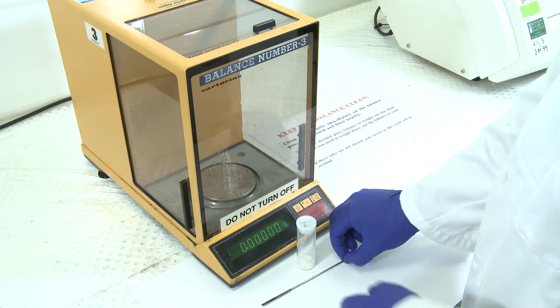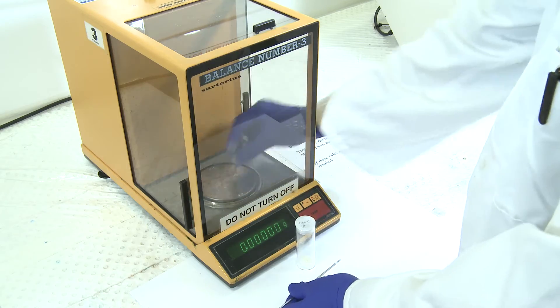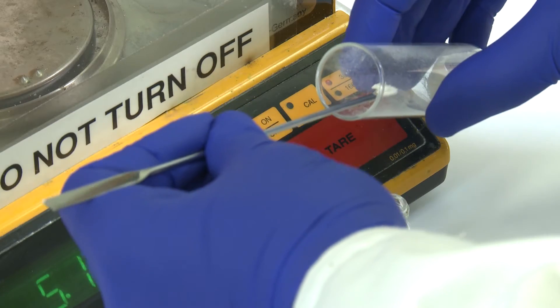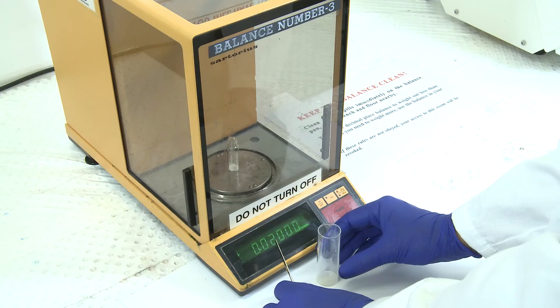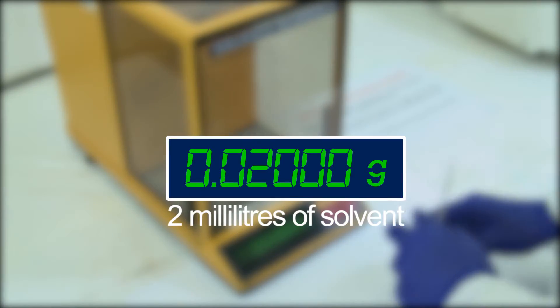Firstly, we need to accurately weigh out our gelator. Today I'll be making gels at a concentration of one weight percent, so we'll be using 20 milligrams of gelator in two milliliters of solvent.